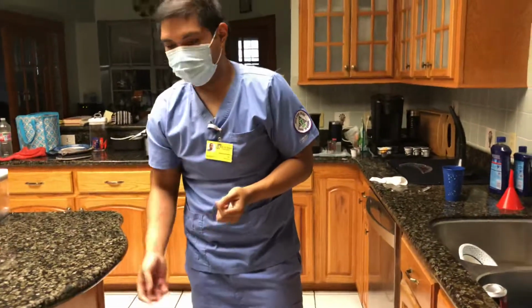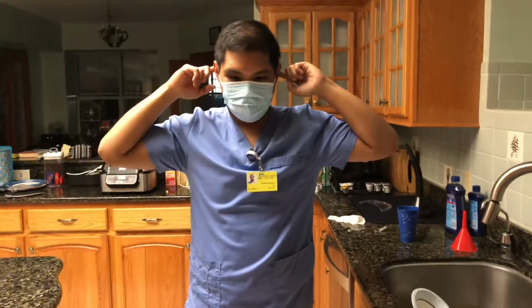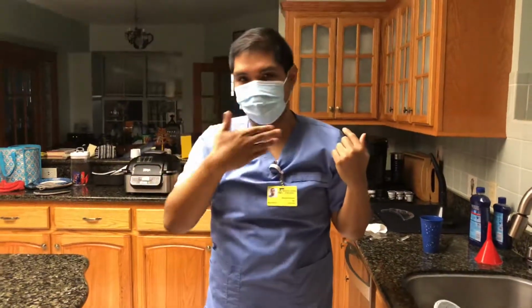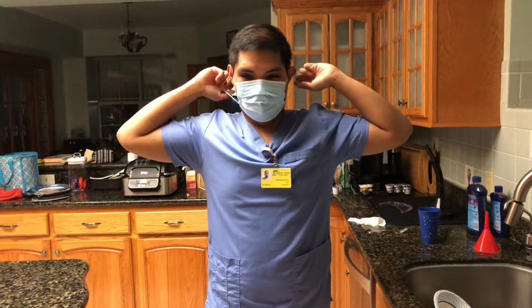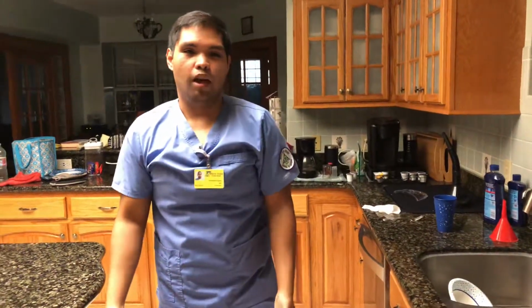And the last thing that we're gonna take off is our mask. Usually you could untie it and then throw it away without touching the outside, because like I said, this part could be contaminated. Mine is these kinds of masks, so I'm gonna take it off from the ear and throw it away at an appropriate receptacle. And that is how you don and doff a PPE.